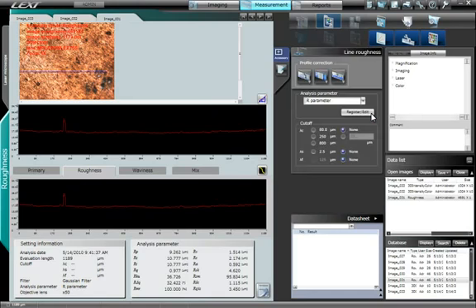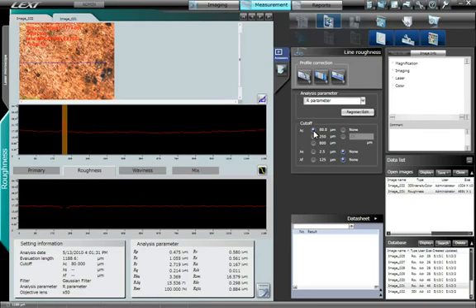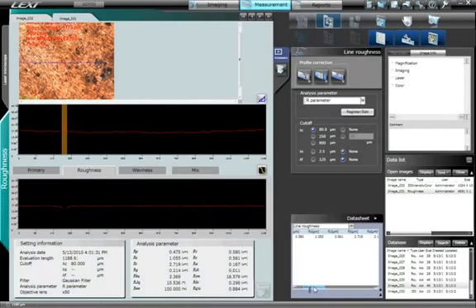Should you wish to use a cutoff filter, select the corresponding button or enter a user-defined cutoff value. Notice how the analysis results are profoundly affected as a result of the cutoff filter. After selecting all of the appropriate analysis parameters, click the button Export to Datasheet to create a datasheet containing all pertinent measurement parameters.